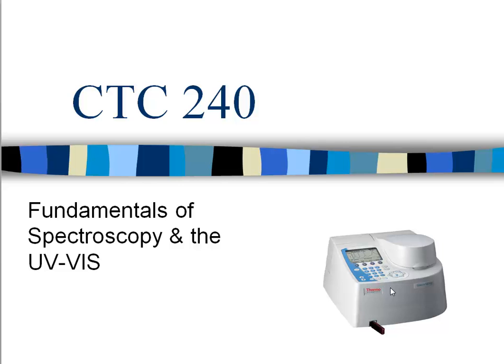So if you're a ChemTech student, you have used an older version of this machine called the Cecil, and this is the newer, more industry-grade machine that you might see when you get a job in a laboratory. So before we go any further, we want to make sure that we have a couple of things clear. And one of these is, what is the definition for UV Vis? So let's pause for a moment and take a look at some of these definitions or some of the terminology that might creep up throughout this first portion of the lecture videos.